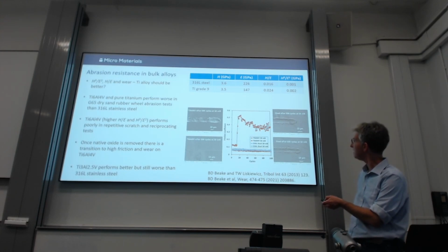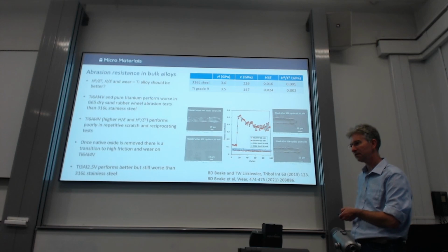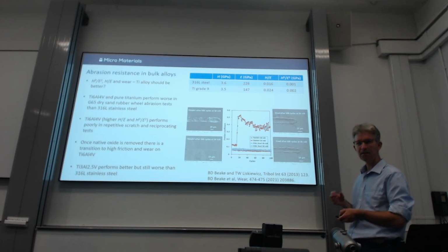So what you can see on the right here now are nanotribo tests, which we haven't really talked about these days, which is a reciprocating wear test option we have, tracking over several millimetres. If you just look at the friction now, comparing titanium 6-4 at two different loads, 30 and 50 millinewtons, against the steel, most of them stay perfectly low throughout. At 30 millinewtons, this oxide is maintained there. So then the mechanical properties win.